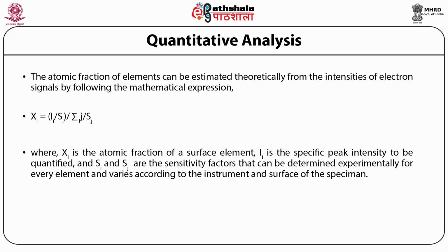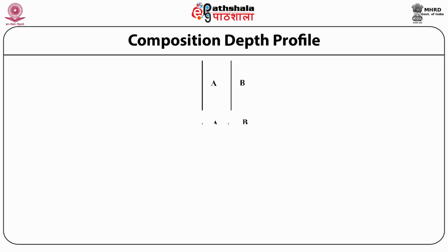Here, the intensity of the element A present among multiple elements differs from the same amount of A element in its pure solid form.